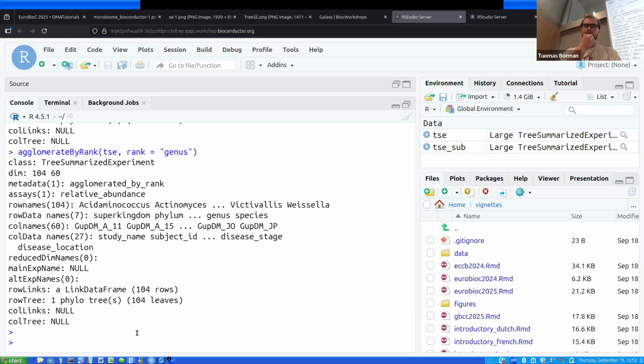I did not get exactly that point. Sorry. I put 1 across the whole genus column, and then did agglomerate by ranks. So I was expecting just 1. Oh yeah, okay. But I have 3, and I assume that's because prior to genus rank there are the 3 superkingdoms. Yes. So there is this agglomerate by rank function, which we have now used, and a more generic agglomerate by variable. And with agglomerate by variable, you will get the 1.